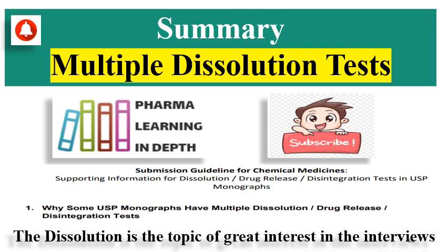If the formulation contains a different salt form or different polymorphic form, at that time the formulation will behave differently in different dissolution media and dissolution conditions. So for that, multiple dissolution tests will be there in the monograph.